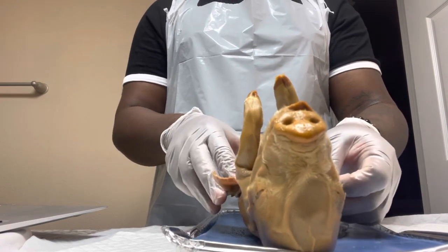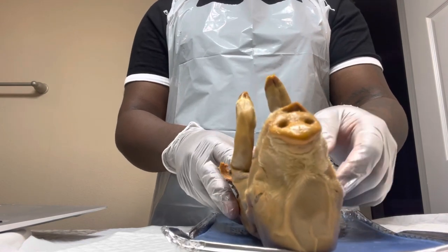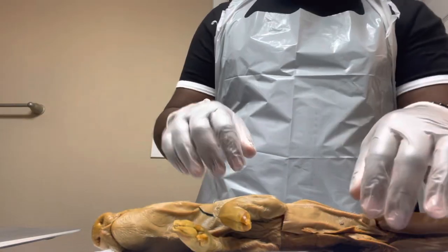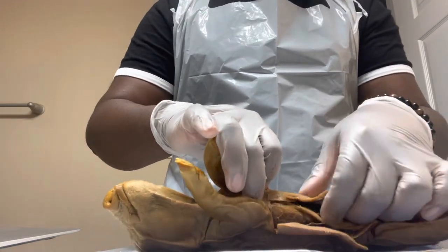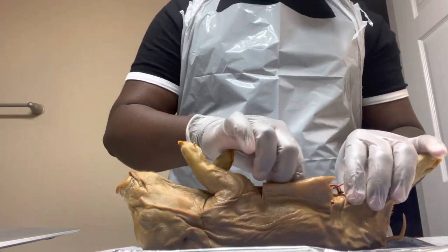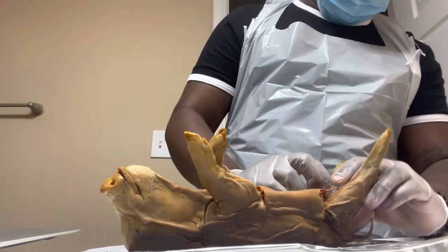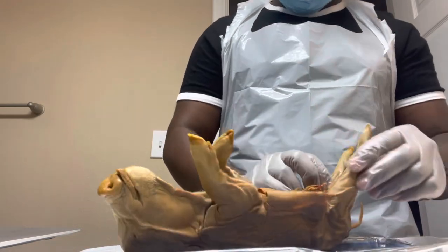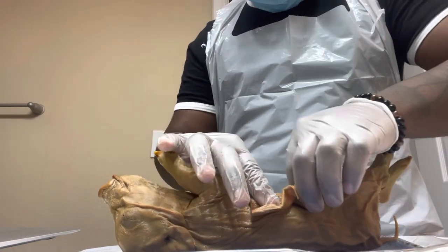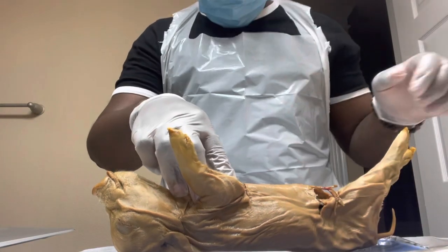He's exposed. My God. He didn't ask for this, to be all flayed out on the operating table. He ain't asked for it. Now what they're wanting us to do, basically I have the skin pulled back, and what I have to do now is expose the spinal cord, which only God knows where that's at because I don't. I feel like I'm just looking at a bunch of stuff. Is that the spinal cord? Oh, homeboy, I'm sorry, Wilbur, but I gotta take you out.